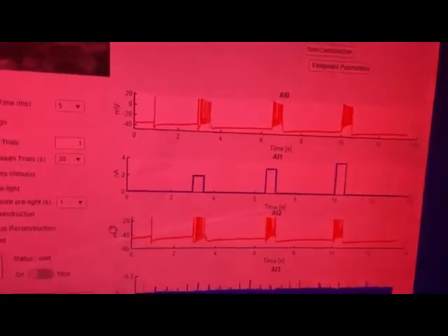We can now record and stimulate the cells with the chosen stimulation protocol and simultaneous recording of the intracellular response of the cell. During the recording itself, the ganglion is exposed to light of a certain wavelength in order to address the dye in the cells. This happens twice per trial, once during the stimulation of the cell and once without stimulation as a control to determine in the resulting visual data when a depolarization of the cell is present.